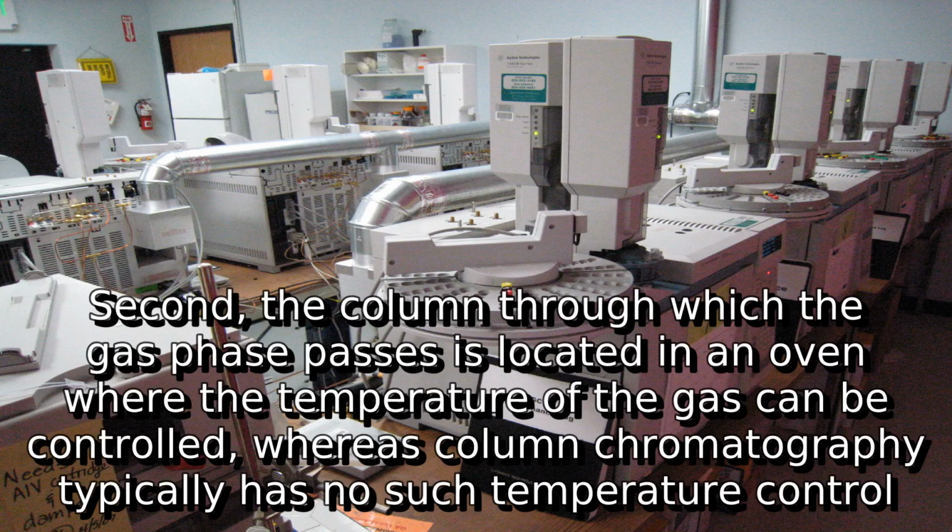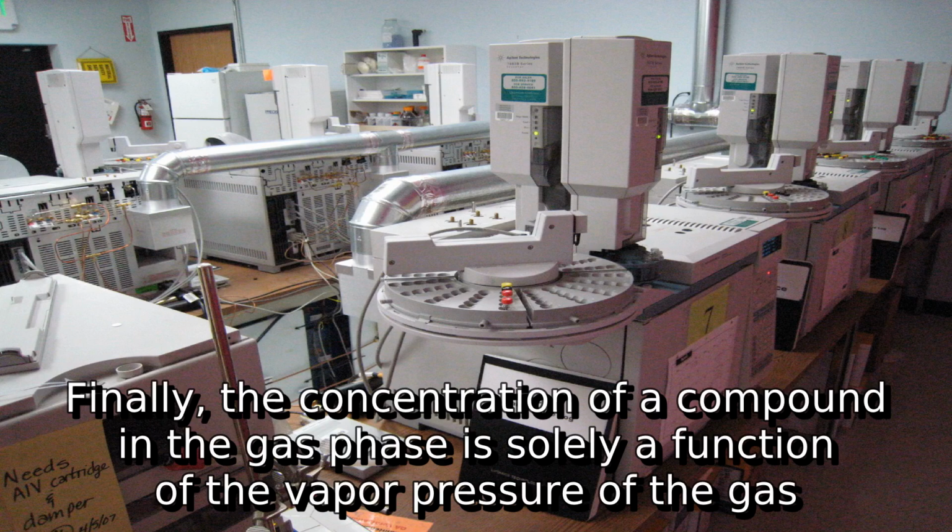Second, the column through which the gas phase passes is located in an oven where the temperature of the gas can be controlled, whereas column chromatography typically has no such temperature control. Finally, the concentration of a compound in the gas phase is solely a function of the vapor pressure of the gas.